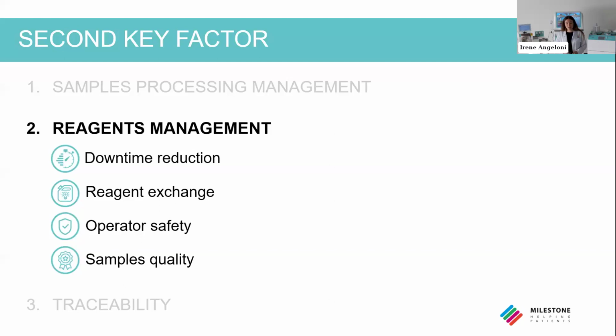Regarding the reagents, we are going to see how it's possible in this context to reduce downtime, and also the aspect of the reagent exchange in more detail. And we will see also how better reagent management can allow for better laboratory management, and most importantly, safety for the operator and sample quality.